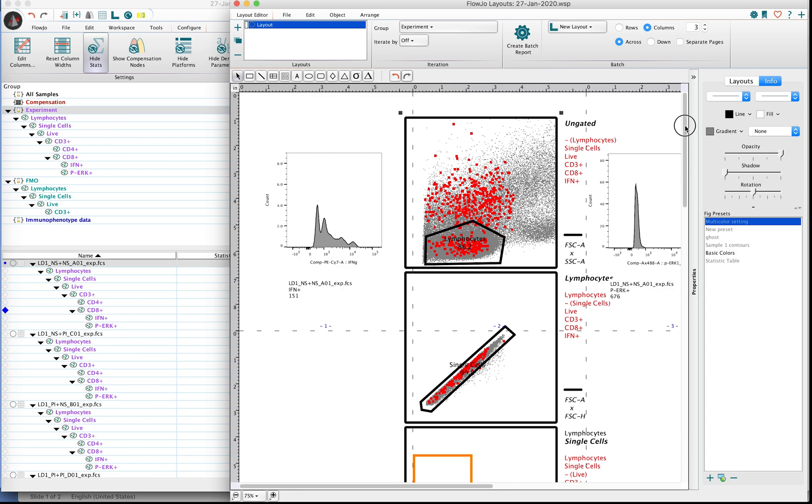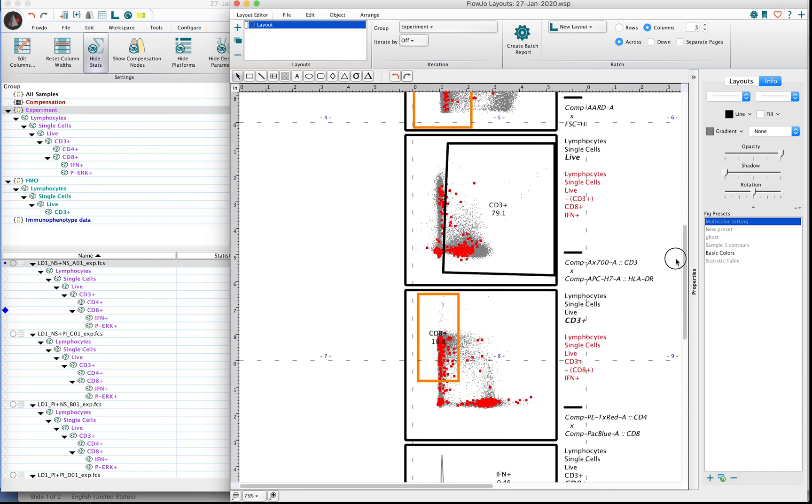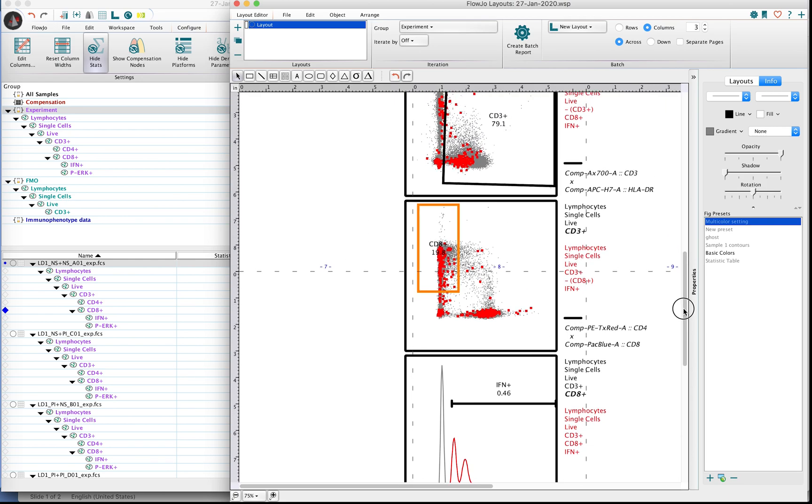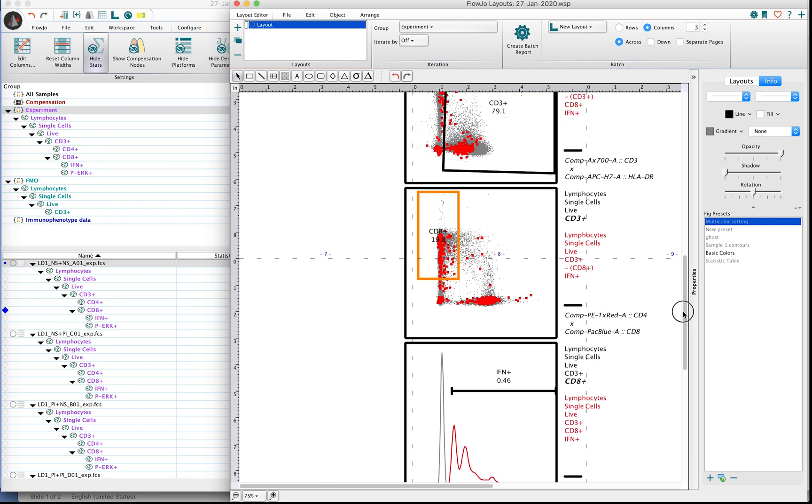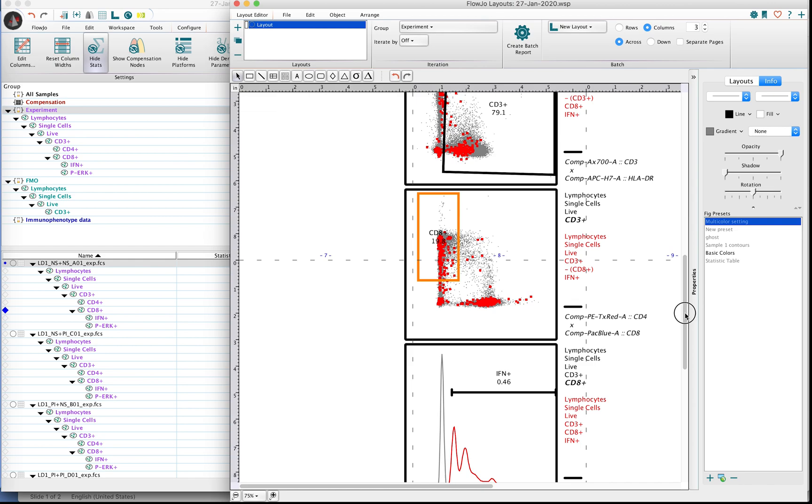And what backgating is trying to do, at least in FlowJo V10 here, is we're just taking this terminal gate, the one that is defining what is interferon positive, and we are projecting this backwards throughout the analysis. So you're basically simply asking the question, where else in my analysis can I find interferon positive events as judged by this gate?